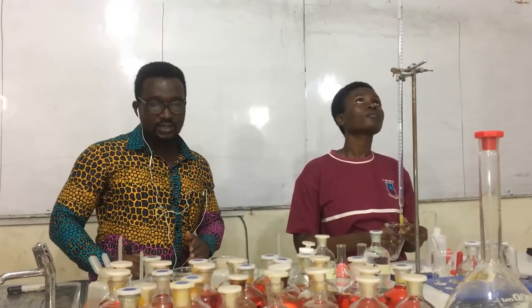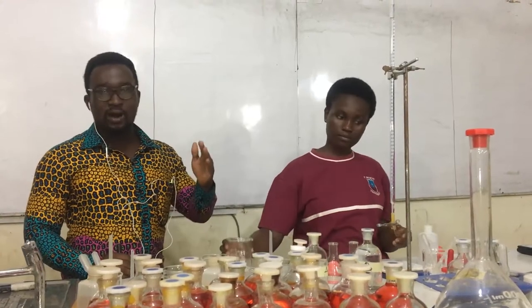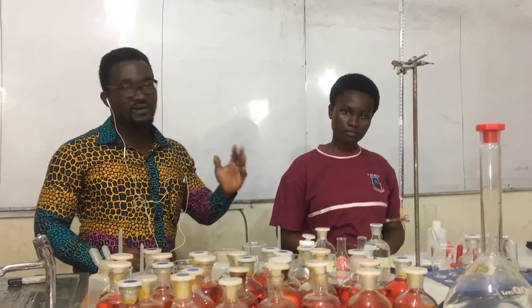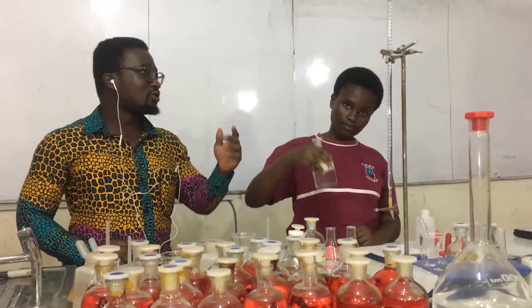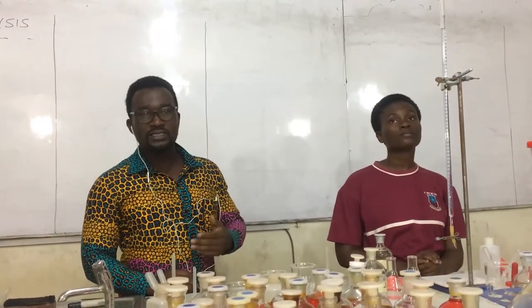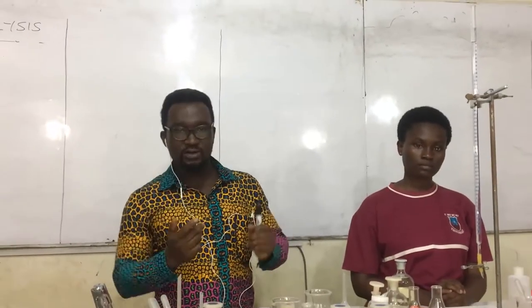What she is doing is what we term as flushing out the bubbles. When you flush out the bubbles, you do so to get the exact volume which is supposed to be measured. So it is always advisable to pour the solution in such a way that it goes above the zero mark, so that you will be able to flush out the bubbles and get a uniform solution in the burette.